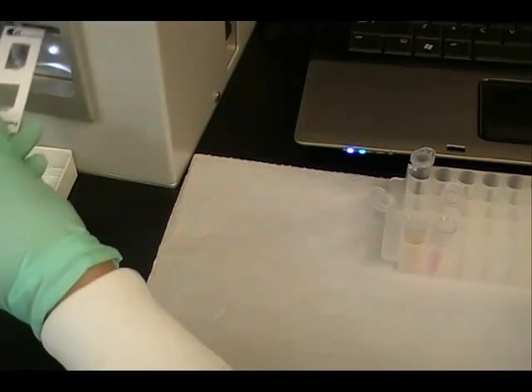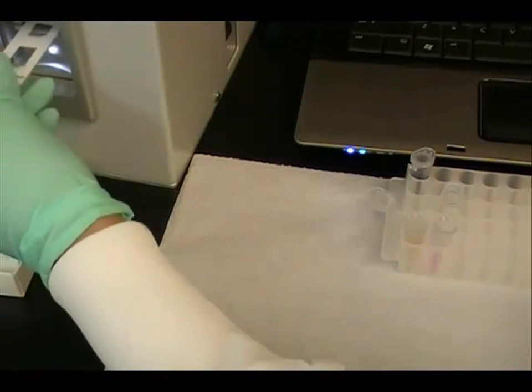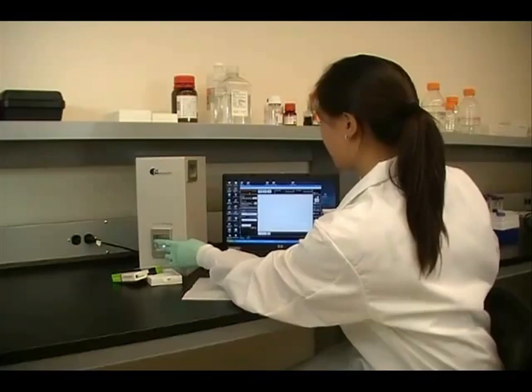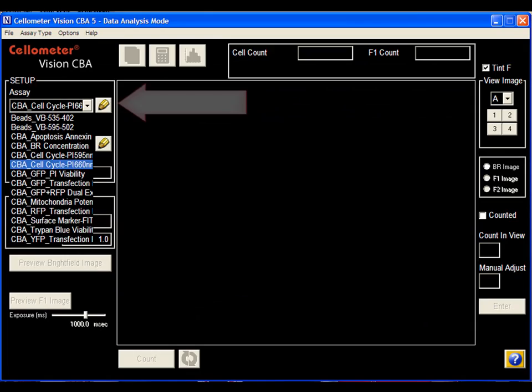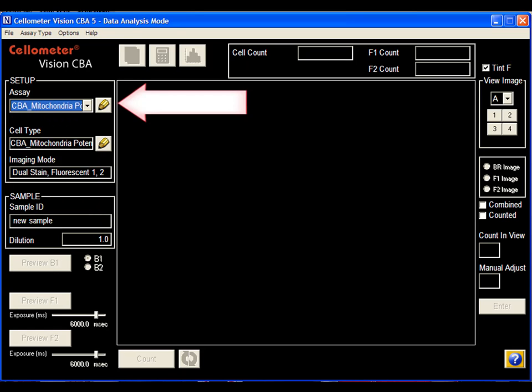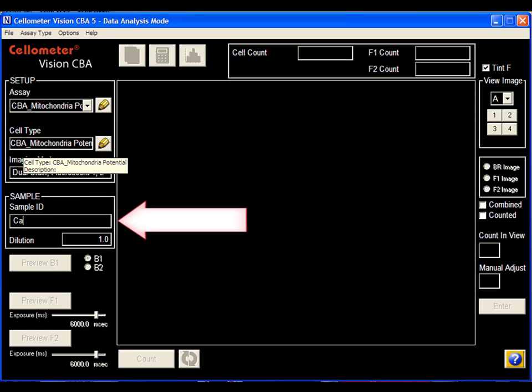The mitochondrial membrane potential JC-1 assay is selected from the drop-down menu. The specific sample ID is entered, then click Count.